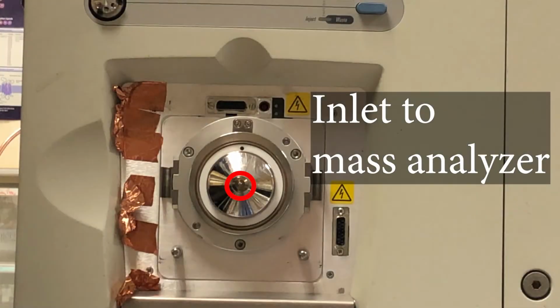Let's look at the equivalent for the LCMS. This is not the LCMS you guys are using in forensic tox, but it's a close cousin. We looked at it last time, and I said, look at that hole. That's the inlet to the mass analyzer. So this inlet is at atmosphere. It's at 760 torr. And so there has to be a lot of pumping that goes on to get from 760 torr in the front of the instrument to 10 to the minus fifth in the back of the instrument. That's part of it, but remember, we also need to focus those chaotic clouds of ions into a nice tight beam.